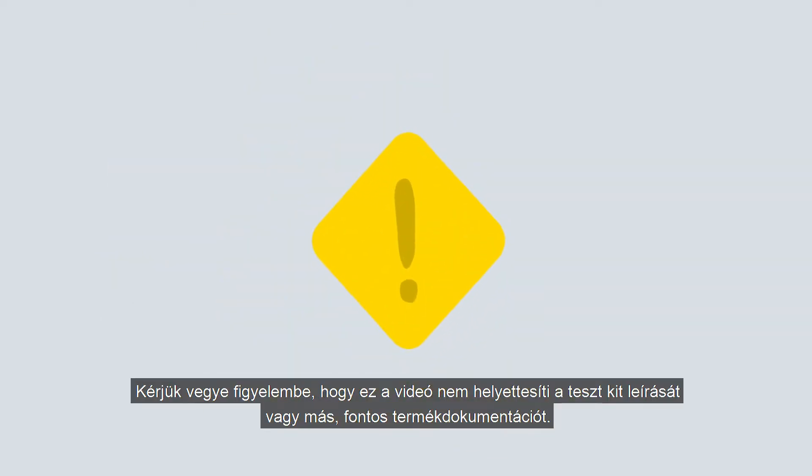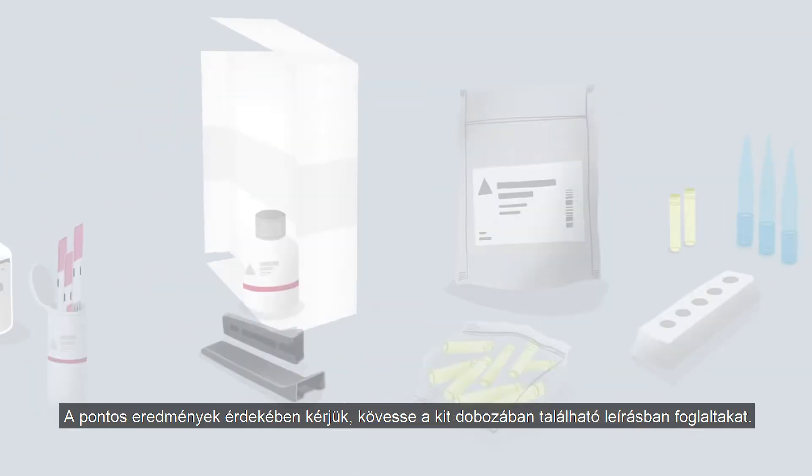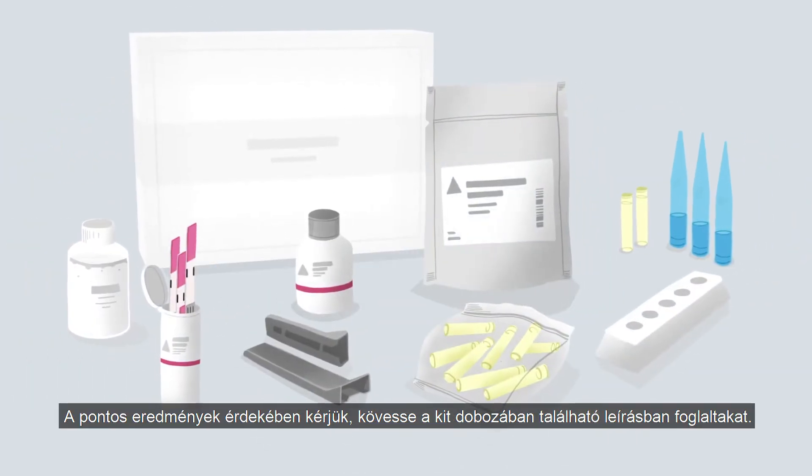Please keep in mind that this video is not a replacement for the package insert or other important product documentation. To ensure accurate results, please follow the package insert that came with your test kit.